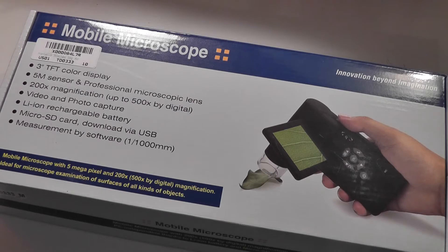You can actually use this to really get a close-up zoomed in view of different materials. If you're in a science classroom, if you're doing a lab, or just for fun, these are all practical uses for this digital mobile microscope.